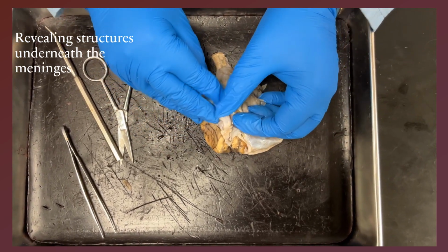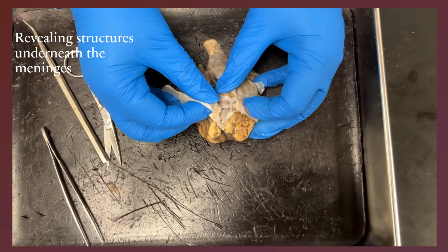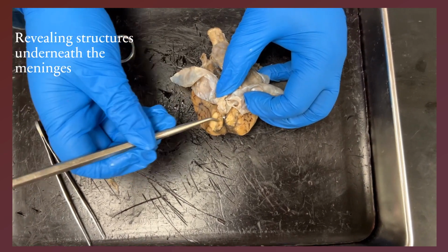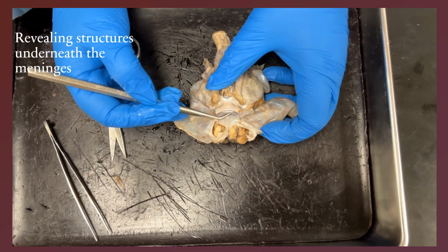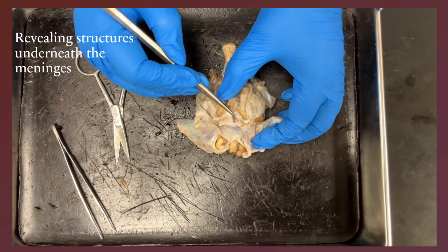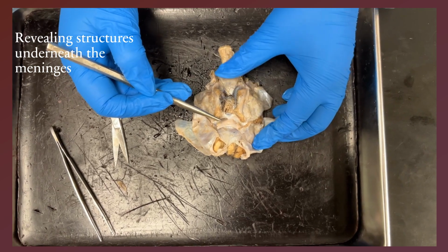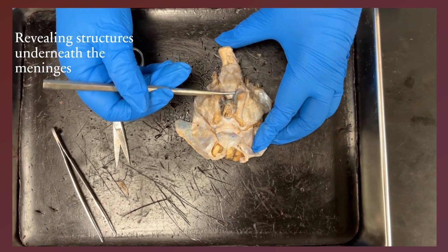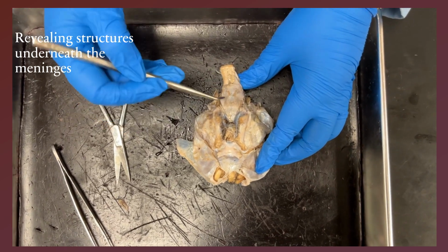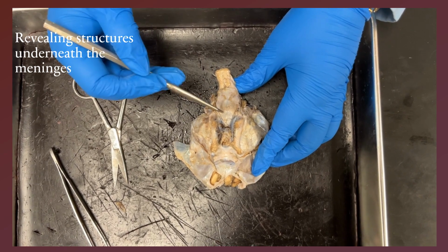I slowly have removed the meninges so that we can save the olfactory bulbs. Here I will do a very careful dissection to remove the meninges from the top of the optic tract and the optic chiasma. And here going inferior posteriorly, once we remove these, we will be able to see the medulla, the pons.